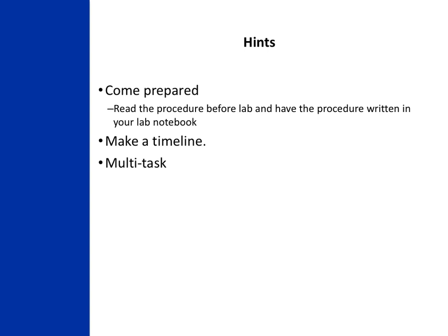Do you have to wait for a solution to react? Well, then go ahead and measure out some of the substances you'll need in the next couple steps. Are you going to need to record a mass too? So maybe while you're waiting, you should go ahead and weigh out the watch glass and the filter paper. Is there some kind of glassware that you can clean so you're ready to leave the lab on time while your sample's in the oven? Identify those types of steps so that you can use your time efficiently and successfully.